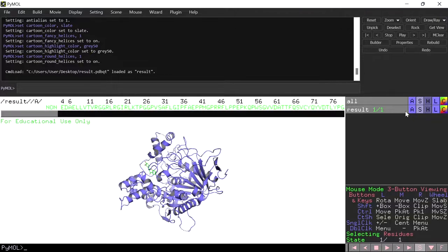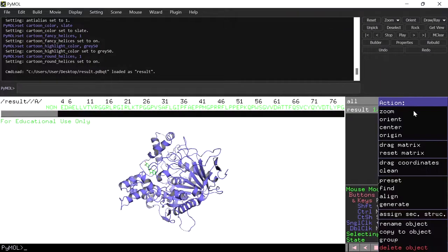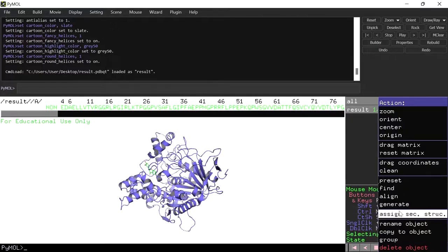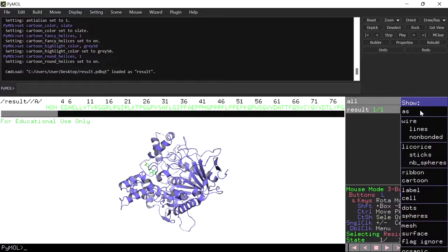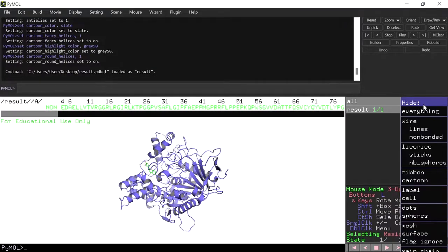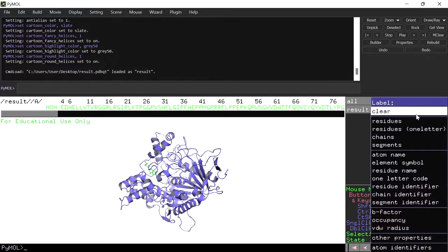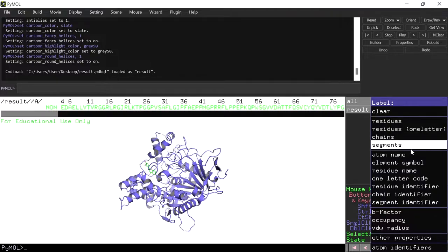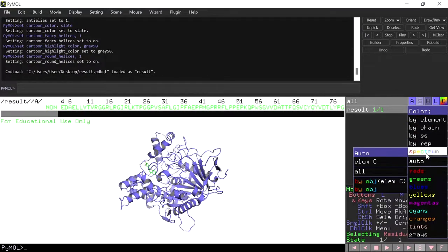Next to each object there are different buttons: action, show, hide, label, and color. In the action button you can rename the object, duplicate the object, remove it, and apply different presets. The show button displays different representations, and the hide button hides them. The label button labels atoms, residues, and molecules, and the color button has different coloring options for the different representations.